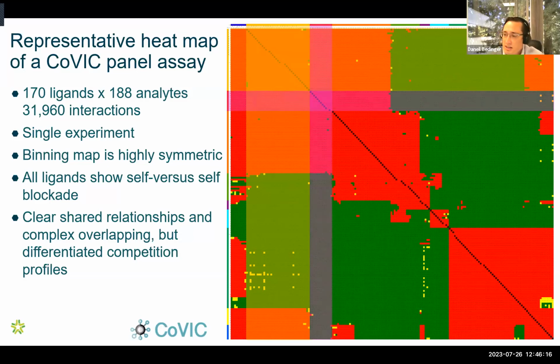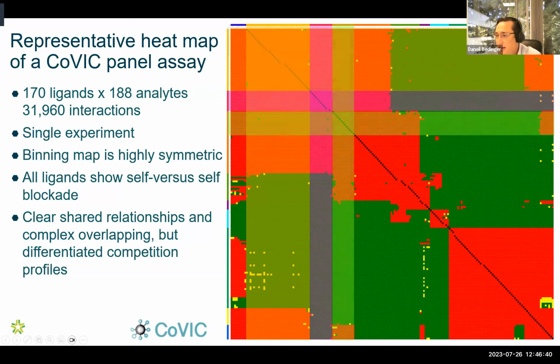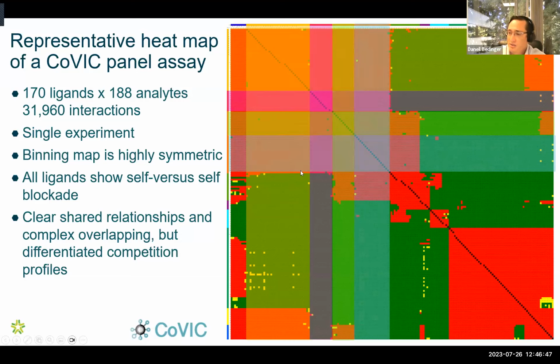This purple community is a closely related community, but it's different in that it has clones from the yellow and blue community that are sandwiching, where in the yellow community they were blocking. So even though these clones compete with those and they share many relationships, due to the resolution of this assay, we're able to say this is a shifted epitope with a different behavior. And you can see you can keep going on highlighting communities that have additional properties and differences. So this is how this is applied.